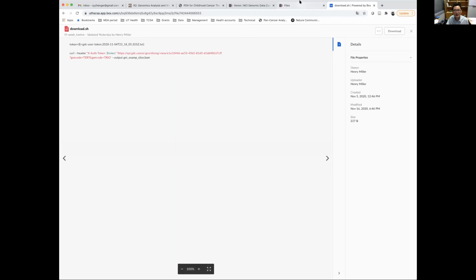But let me show you something else. Luckily, I have some BAM files from my previous analysis, and these BAMs were generated by a different tool. So all the reads are here, but what I can show you is only half of the fusion reads, because I have these BAMs only for one specific gene, not for both genes. Let me show you how to visualize it.